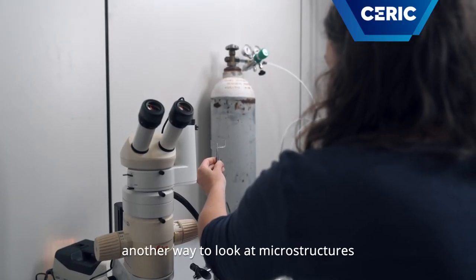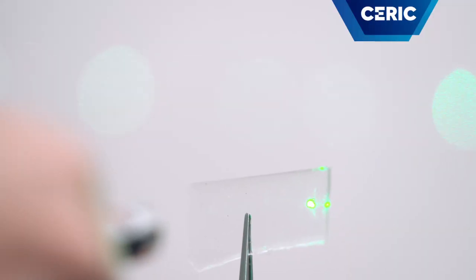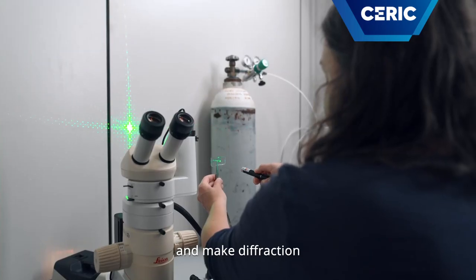Another way to look at microstructures is to put a laser on them, because these structures are regular and make diffraction.